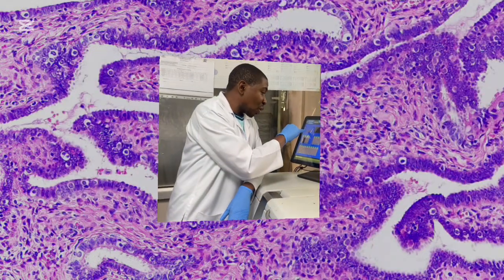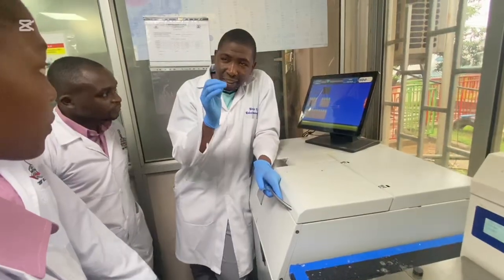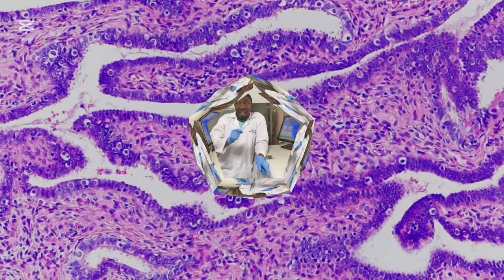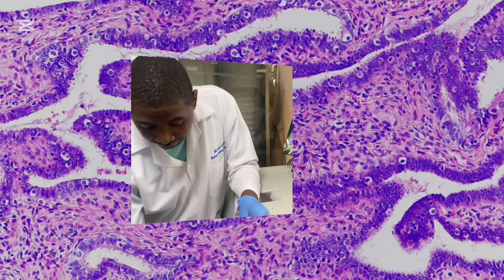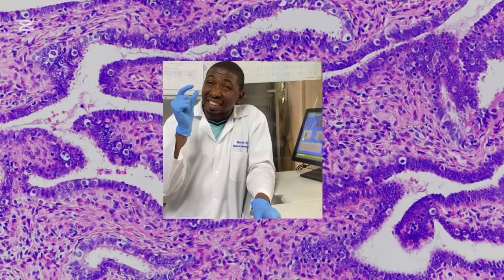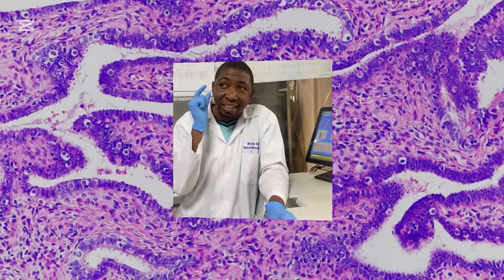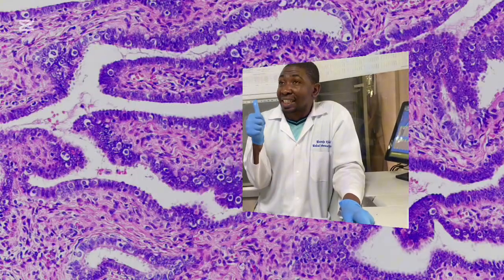Then we have what we call the enhanced heat exchanger. Ideally, dehydration and clearing are done at room temperature. But for infiltration, we need heat because paraffin wax must remain in a molten state to penetrate tissue, the mere fact that it is viscous.